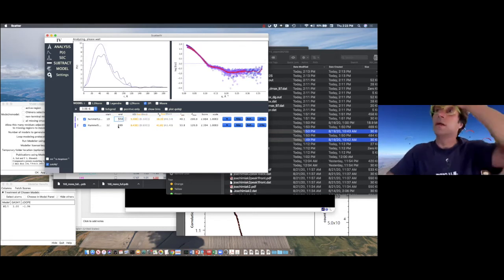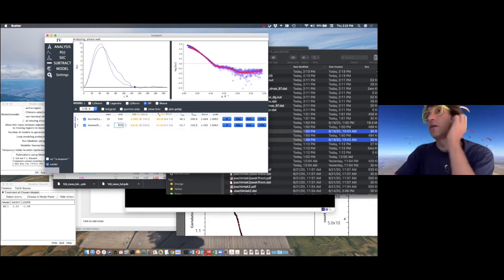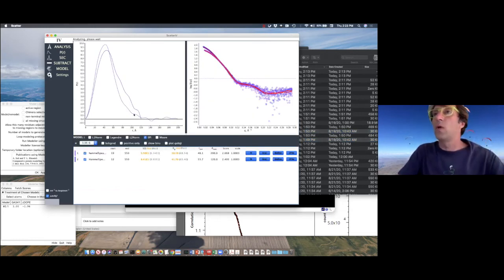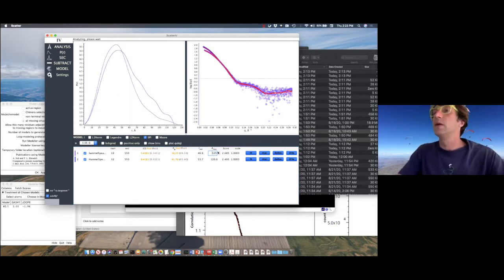So you basically look at the smoothness of the pair distance distribution function; the smoother, the better. And you can already distinguish that if you extend the Dmax to some maximal value, like 200 here, it's not right. When the pair distance distribution function hits 0 on the y-axis, that's where it is supposed to end. So this is about 125, 130. Let's try this way. Okay, we can extend a little bit.